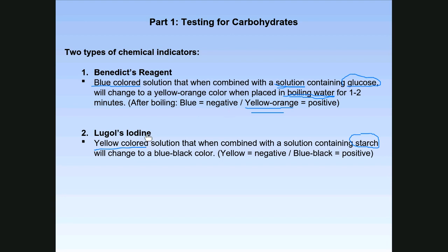Likewise with Lugol's iodine here, it's a much simpler test. First and foremost, if you read here, there's no mention of boiling like there is up here for Benedict's. Lugol's is real quick. But whenever you want to test a solution for the presence of starch, you take a little bit of the solution, transfer it to a porcelain dish or a test tube, add a little bit of Lugol's iodine to it, okay?